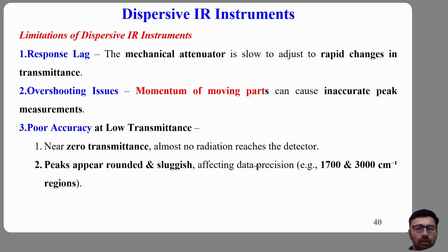In our next lecture, we will continue exploring infrared instrumentation by examining infrared radiation sources and IR detectors, also known as transducers. We will see how spectrometers generate infrared radiation and how detectors convert invisible molecule transitions into measurable electrical signals.